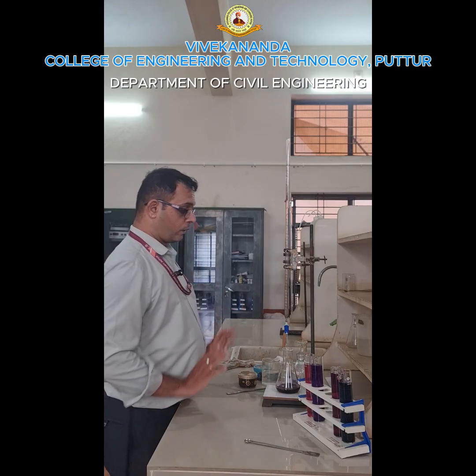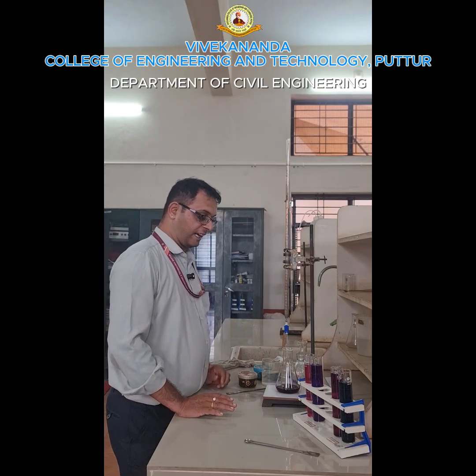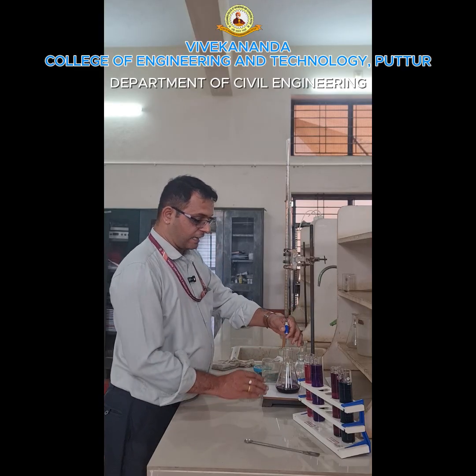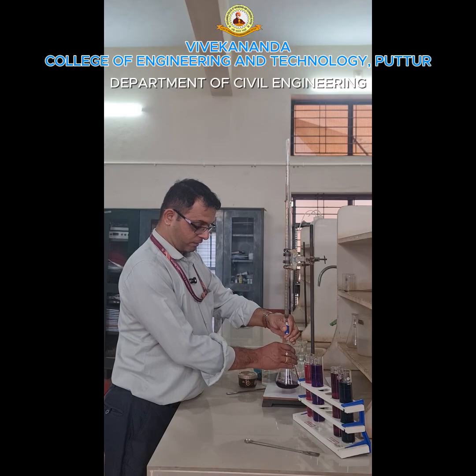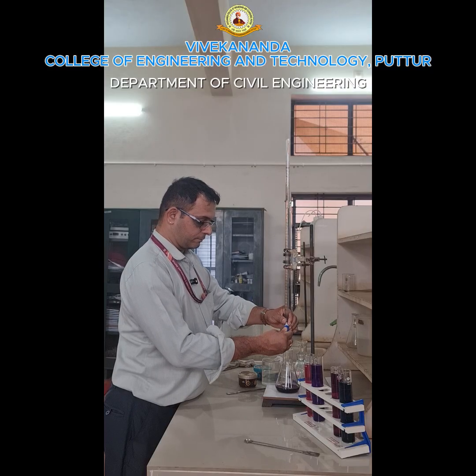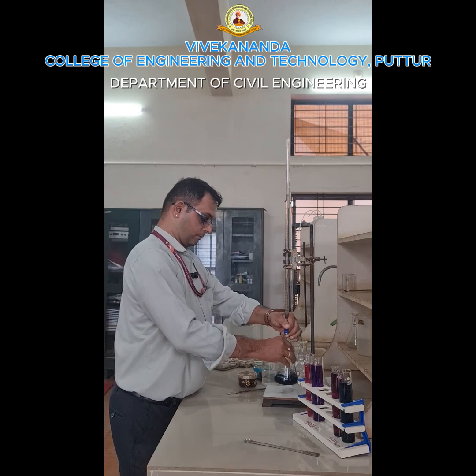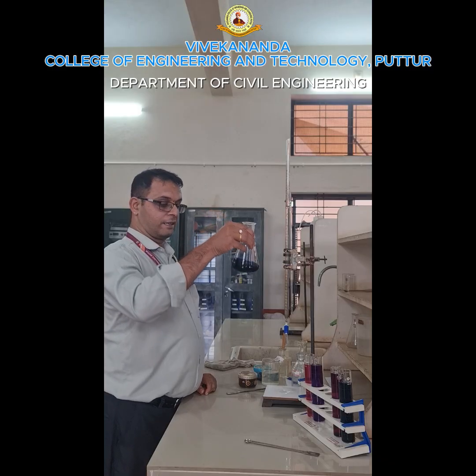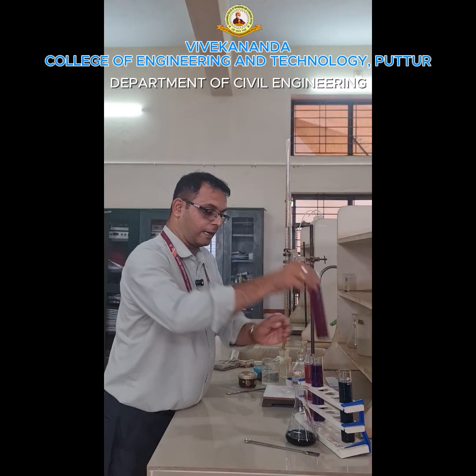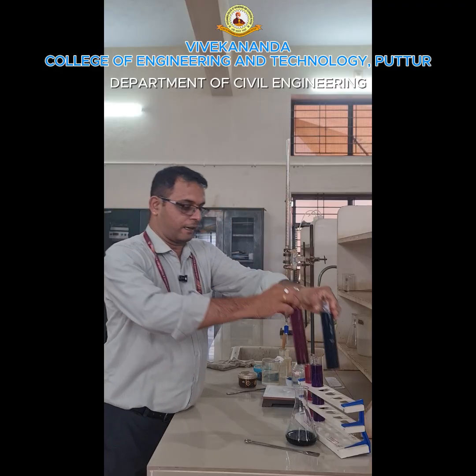Right. So once I have prepared the chemicals and added the indicator, now I have to titrate until the color changes to blue. So slowly I have to titrate. Now the color changed to blue. So this was the initial color. This is the final color.